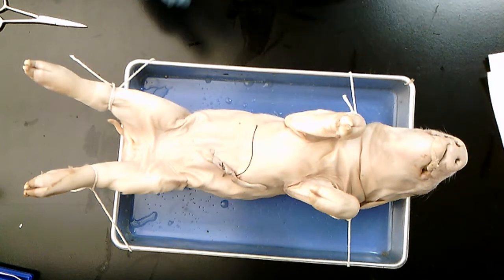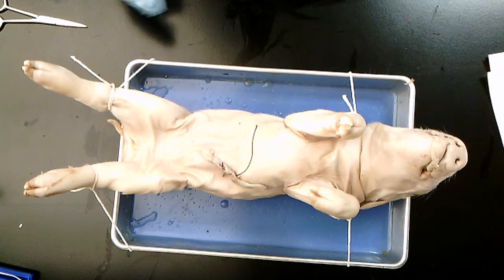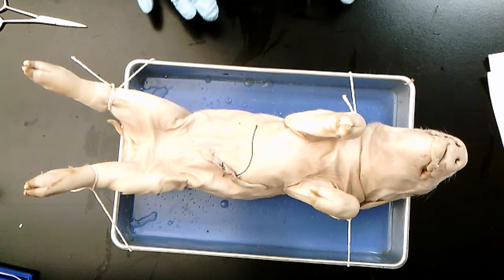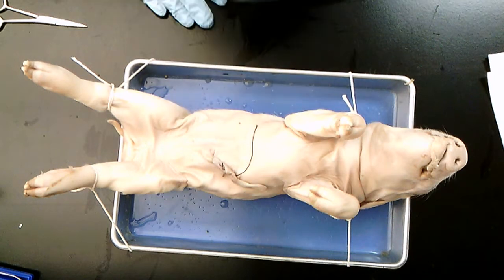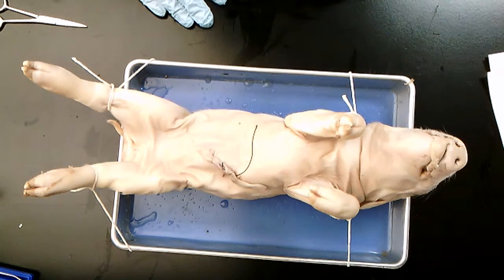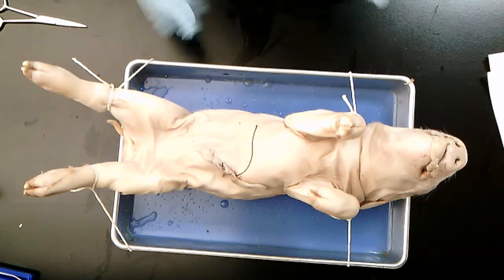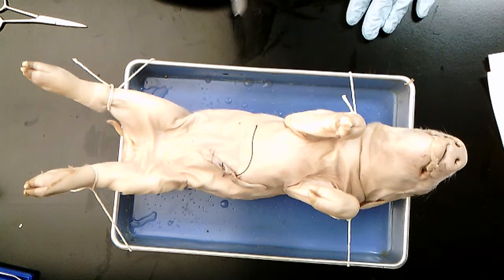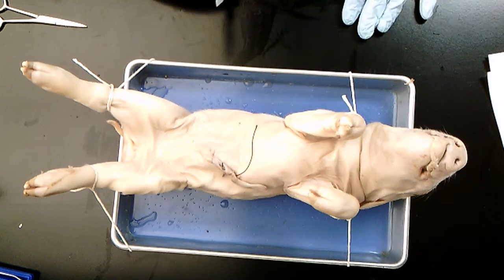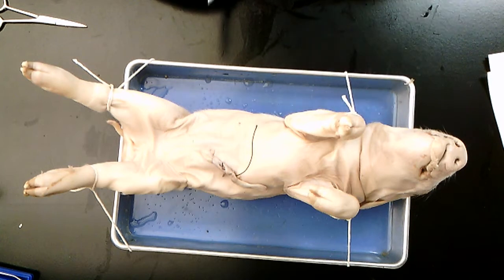One of the rules of the CDE that day that we're going to announce before each session is that we only are going to allow one student's hands on the fetal pig when the scalpel or scissors are being used. That way we're going to avoid potential fingers from getting in the way. So if you have one student cutting, it's only that student's hands that should be on the fetal pig. And that's what the string is going to help with.